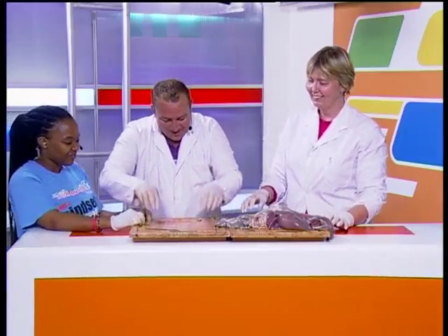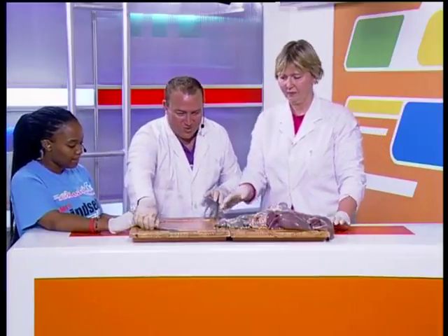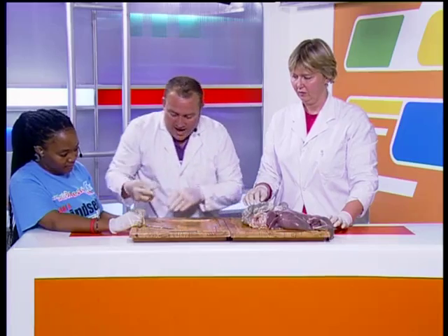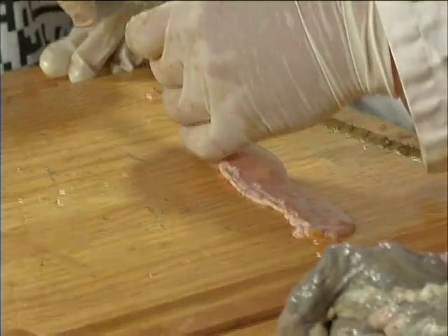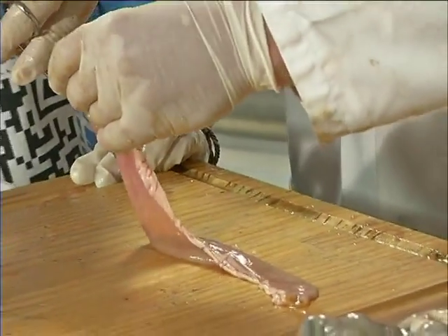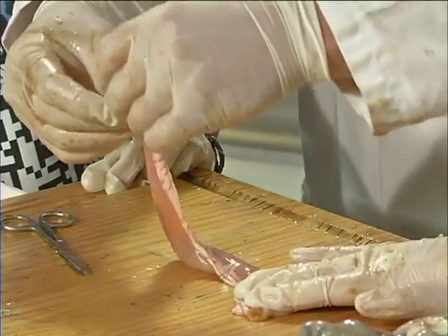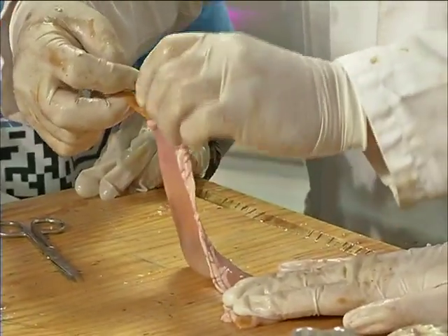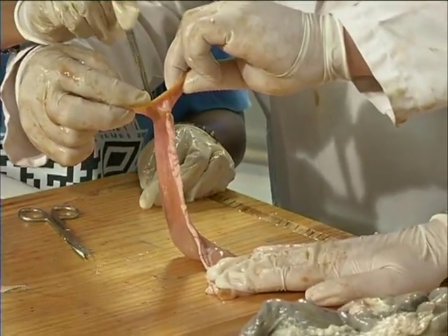Right. So now we've got the small piece of small intestine. Oh, look at that. Still coming out. So what I'm going to do, I'm going to take a pair of scissors because I don't want to cut right through it. I'm going to go in, snipping at the bottom where everything can run out. So please close that hole there, it's going to run. Okay, Luni, take a knife and cut over here. That's it. There we go.